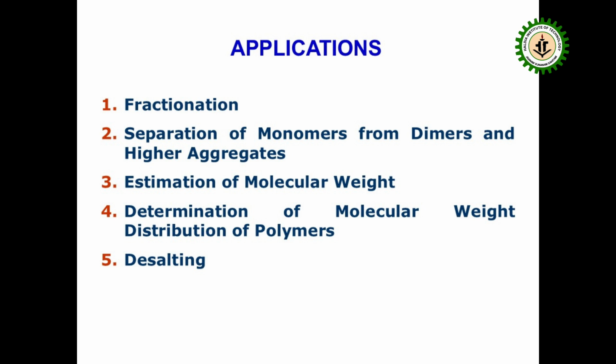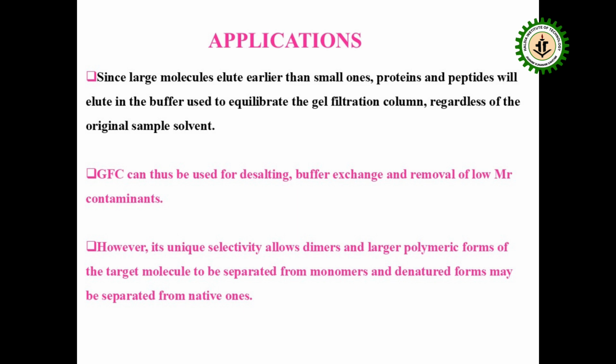Determination of molecular weight distributions of polymers, and then desalting. And we can also use the gel filtration media for removing detergent. Since large molecules elute earlier than small ones, proteins and peptides will elute in the buffer used to equilibrate the gel filtration column, regardless of the origin of the sample or the solvent.